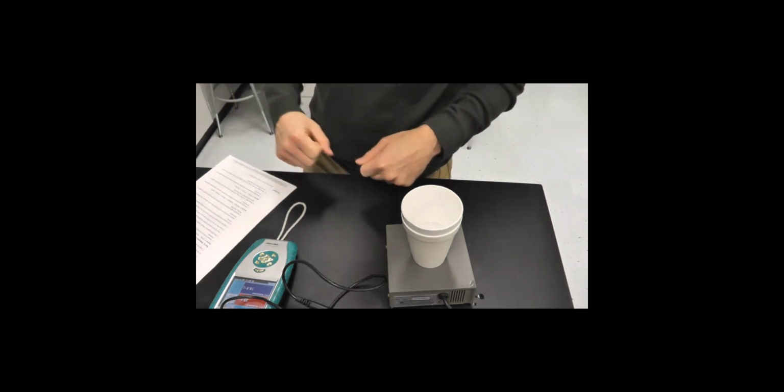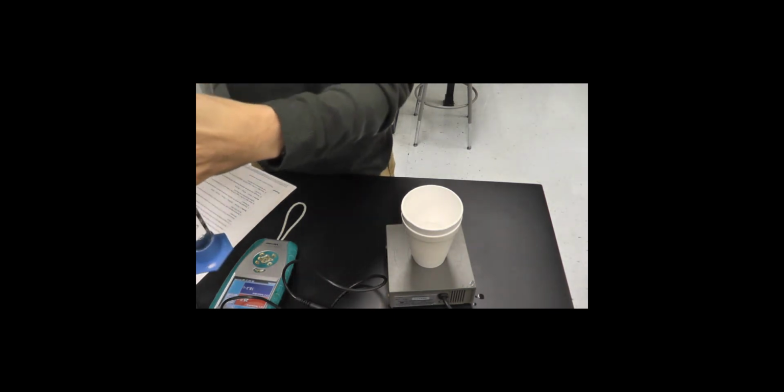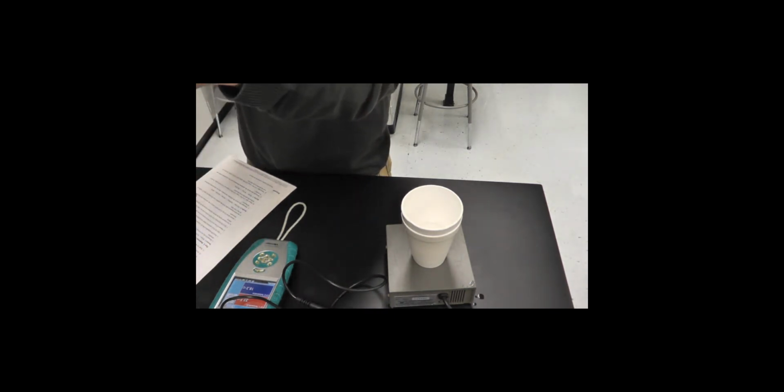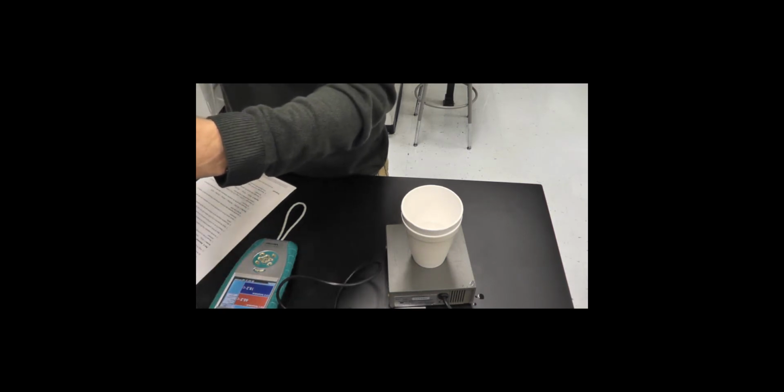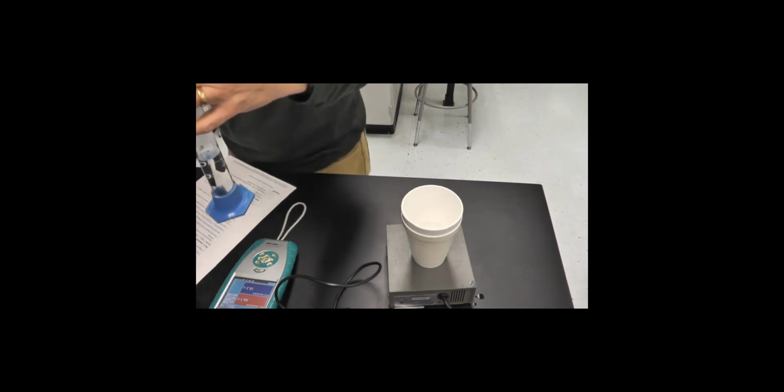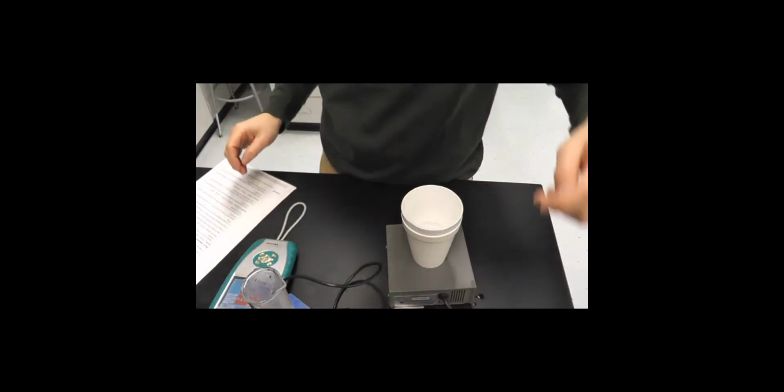We're going to combine them. Let me just do this real quick. So I need 50 mils of hot water, pretty much as precisely as possible. I'm going to measure out how much I have and get its temperature. So it looks like our initial temperature is about 67.3 degrees.